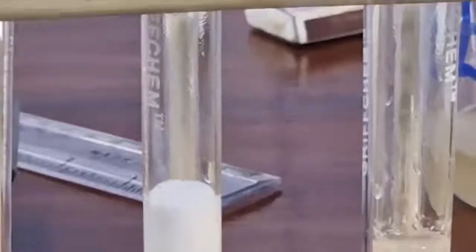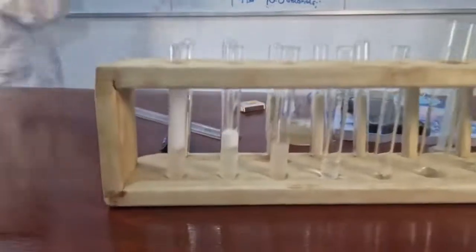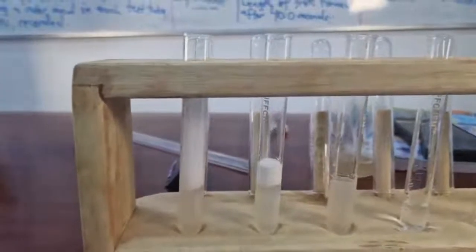I think the length is 0.0. The length of the froth formed in 40 seconds for test tube C is 0.0 centimeters. So I'm going to prepare the table where we are going to put our results.